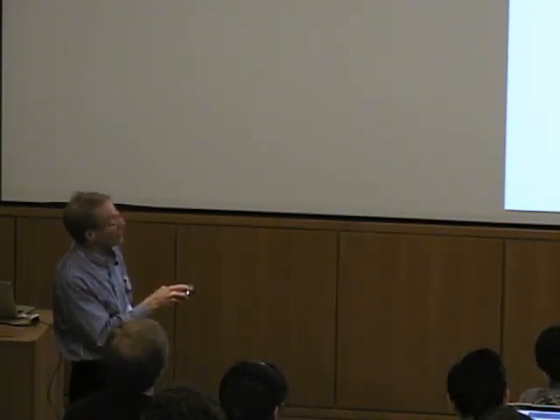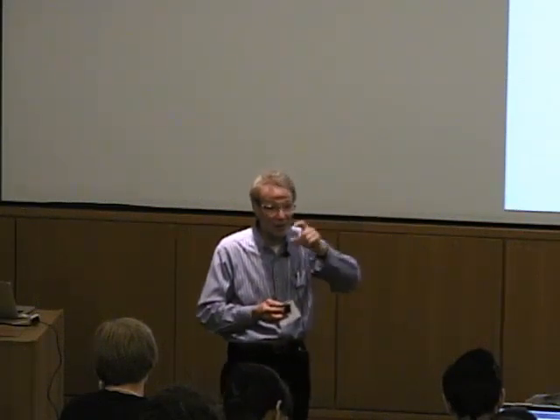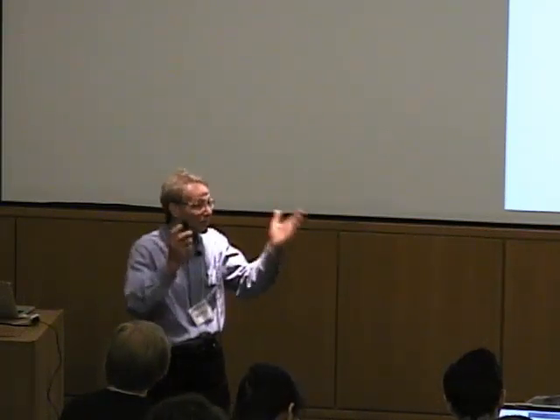Let's see. Slow kinetics. Well, remember, it's stirring. That's a little paddle that stirs things, so you get rapid mixing. Speed up the paddle, make it spin faster, or go to a higher temperature. Okay. Sources of error. I mentioned the stoichiometry is a softer number. That's because it depends upon two concentrations and different volumes, the volume in the cell and the volume that you're adding with each aliquot. So there's a lot of places that error can come in there. 0.8 is usually 1. 1.2 is usually 1. But 0.5 is probably 0.5, and you might want to think about that.